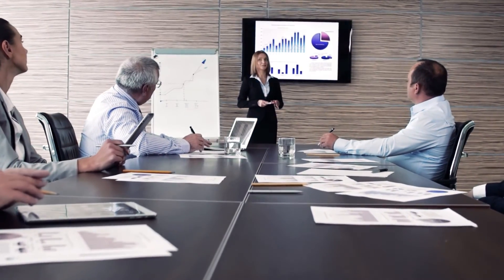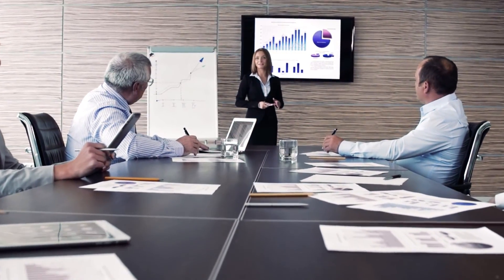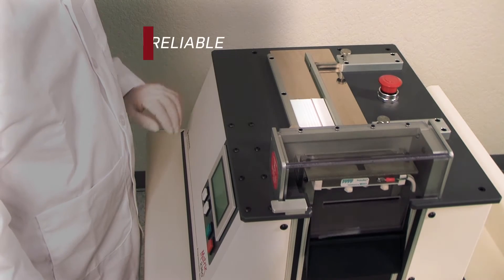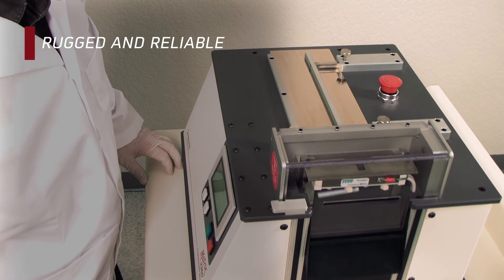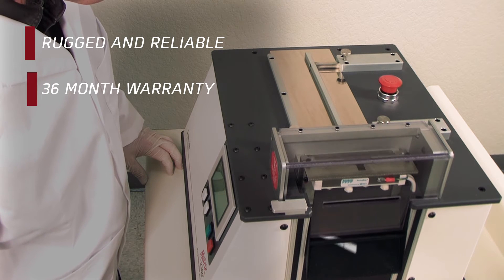Improved efficiency and reduced waste means lower manufacturing costs. Not to mention that these machines are rugged and reliable. All kinematic benchtop modules are backed by a 36-month warranty.